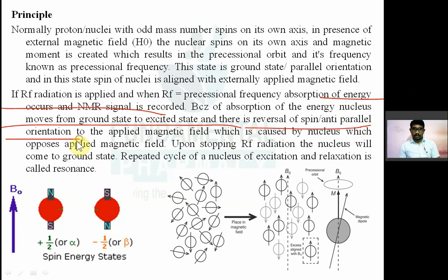Okay, to the applied magnetic field, which is caused by the nucleus when it opposes the magnetic field. Upon the stopping of radio frequency radiation, the nucleus will come to ground state.